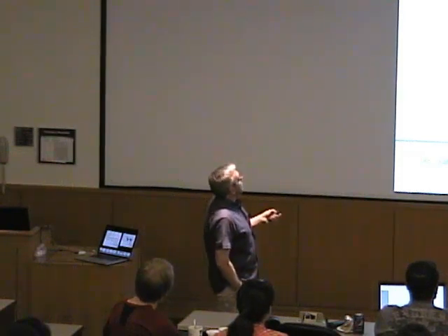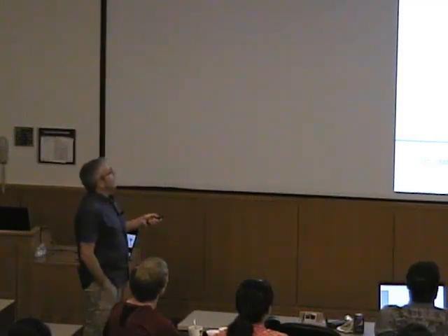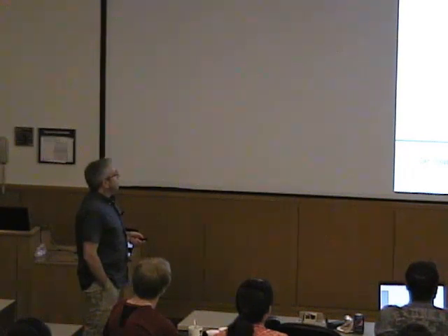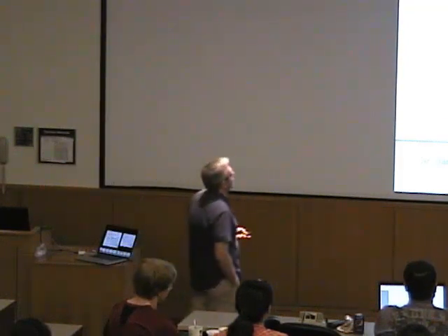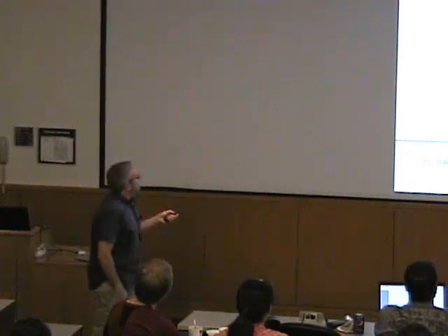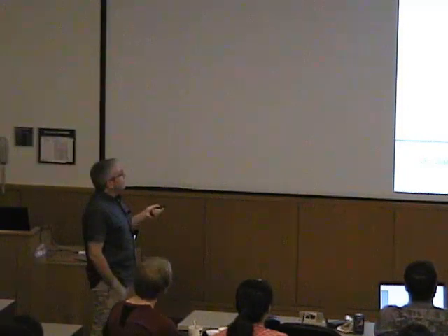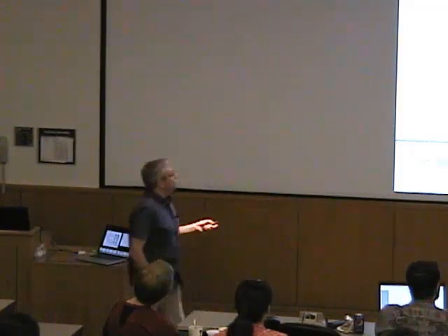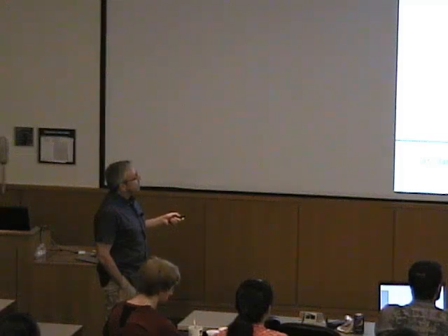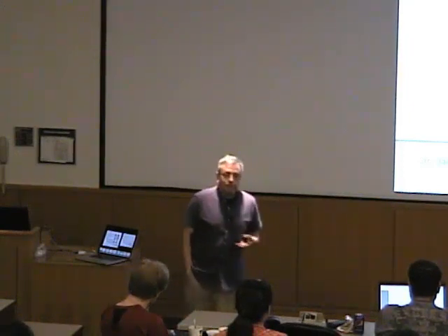Or it's these extremely big things like the tri-snRNP, which is a part of the spliceosome, 3.7 angstroms resolution, incredibly big thing, wonderful story. And you see RNA and protein in really sufficient detail to build atomic models. So this is really where those methods are coming together. And of course, they even say at 2.3 angstroms, you can start to look at drug targets and look at ligand binding to such drug targets. I'd be a bit cautious at that point, but even so, you do get these amazing results that totally wouldn't have been possible even 2 years ago. So calling this a revolution is definitely not an exaggeration.